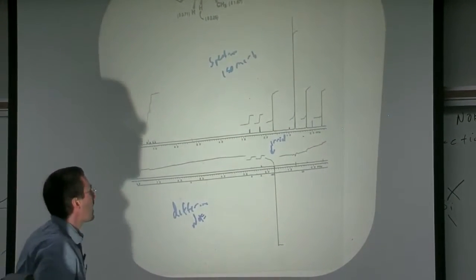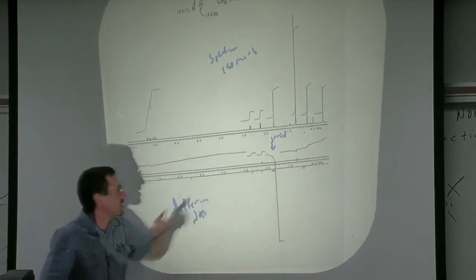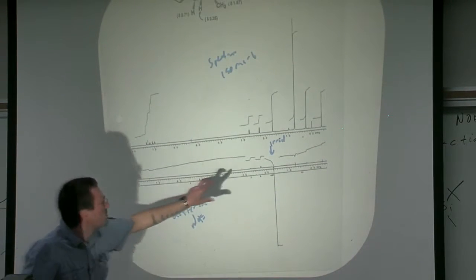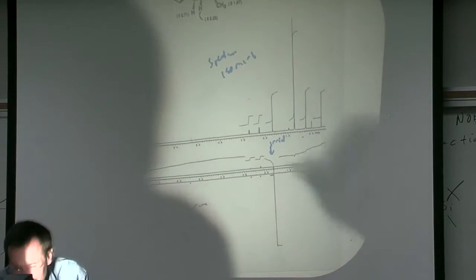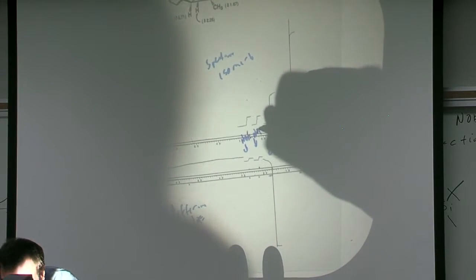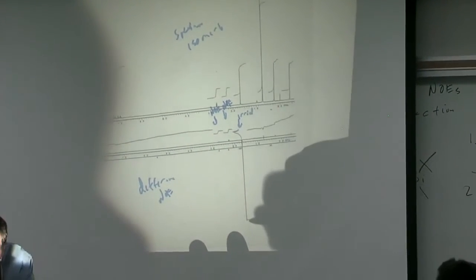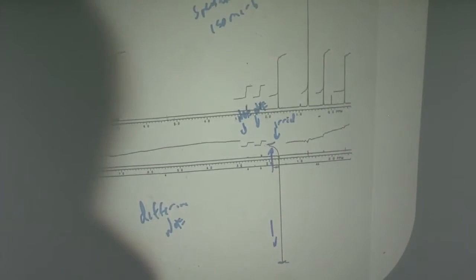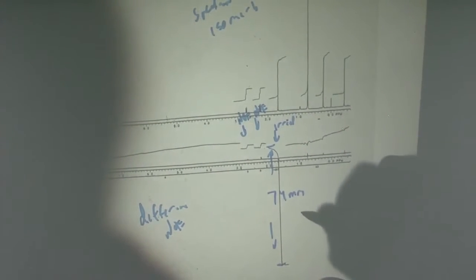And we don't see a heck of a lot. You can see this is an example of a subtraction artifact here, but you see very clearly those 2 ring protons have nice NOEs. If I want to know how big an NOE, I can slap my ruler on this integral. I've already done this. This distance here was 74 millimeters, and that's for 3 hydrogens.